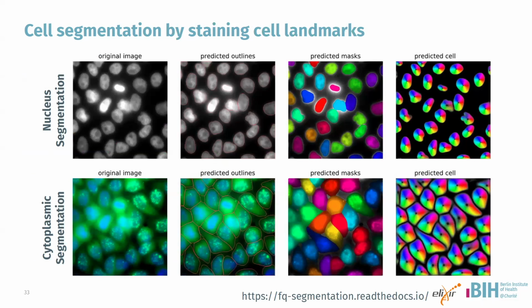So as I mentioned before, for a very long time, we've been staining the nucleus using DAPI. But this is not really representative of the cell. It's somehow, I guess, a legacy thing that we did when we were just happy with finding the nucleus and assuming the cell was perfectly uniformly shaped around that nucleus and expanding it. But this really isn't the case. So we're moving away from this idea of doing nucleus segmentation and starting to look at different types of markers of cells. Can you get something from the cytoplasm? Can you get something from the membrane regions and use that to more accurately delineate the borders of these cells?